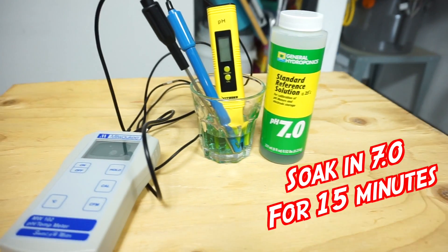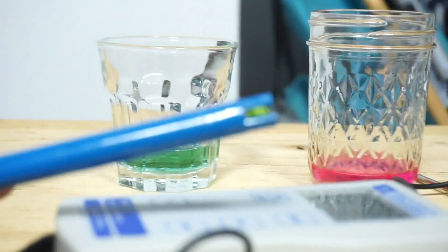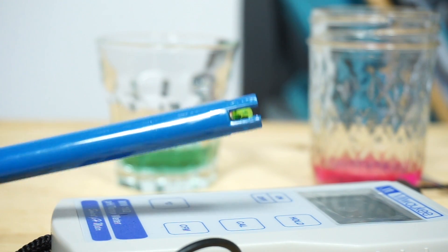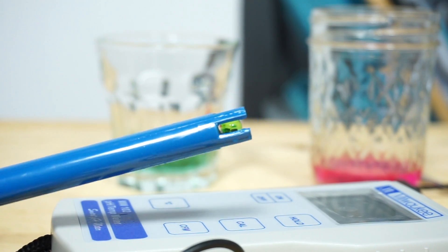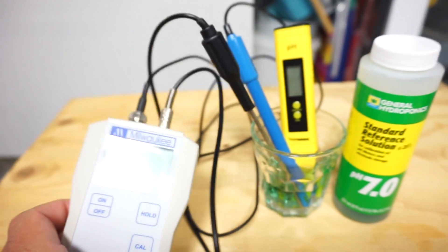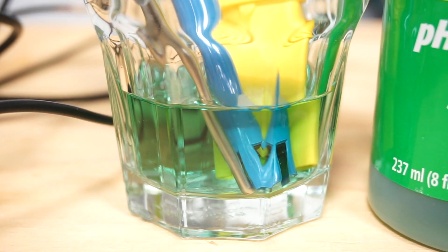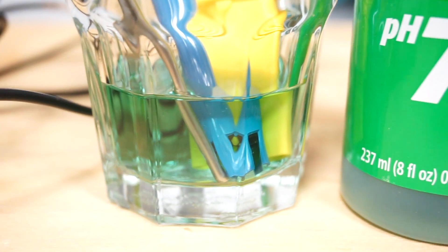Before you even turn it on or put batteries in it, let's hydrate the probe — also called an electrode, same difference. You don't need to waste a ton of solution, just make sure the probe tip is touching it. The solution is kind of pricey, so never, ever pour the solution back into the bottle after you're done calibrating. After we wait 15 minutes, let's begin calibration.